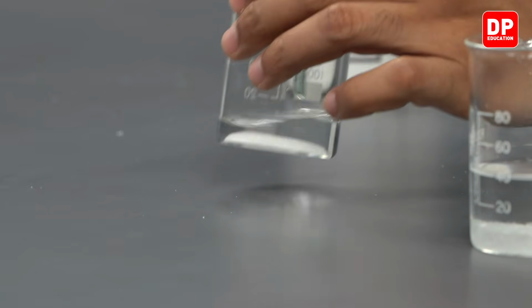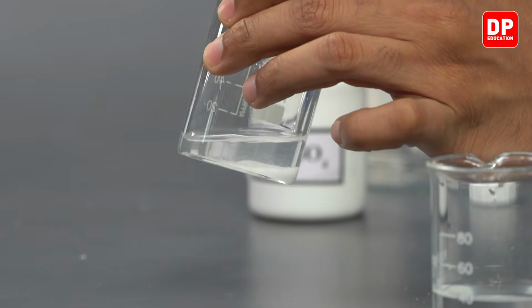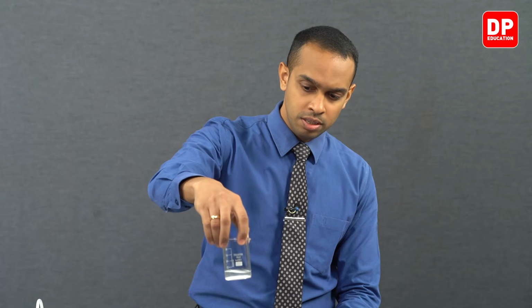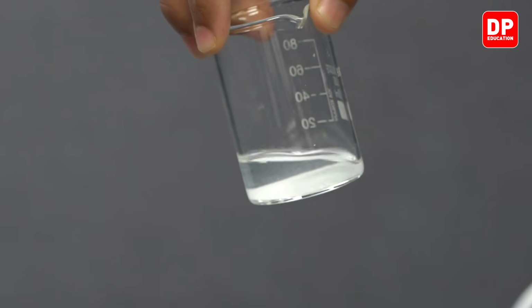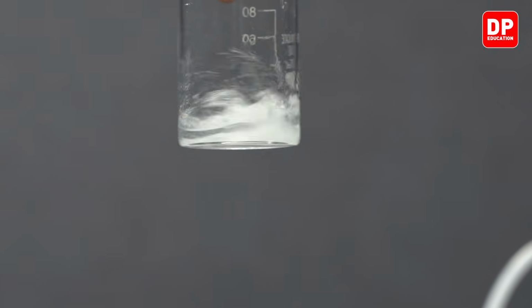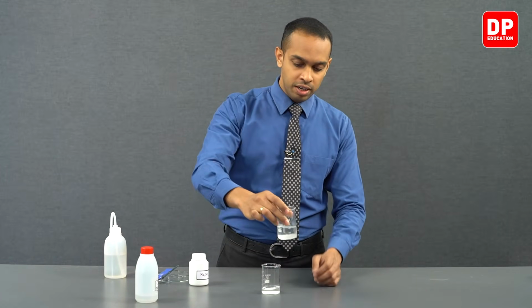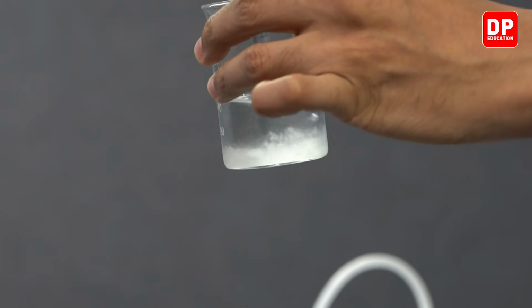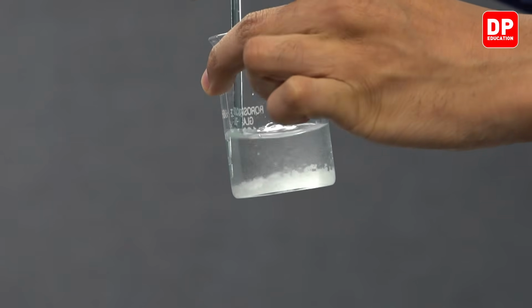We will mix it with a stirring rod as well. As you can see, students, when mixed in methanol, the sodium sulfate does not form clumps. Over here, we can very clearly see the formation of clumps. You can see sodium sulfate is present as clumps of sodium sulfate.